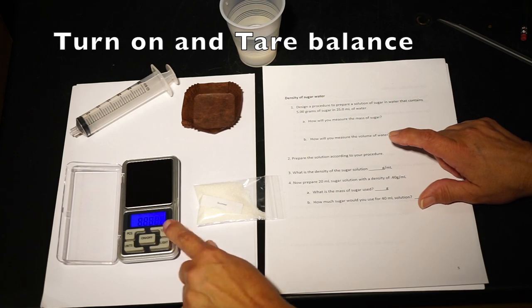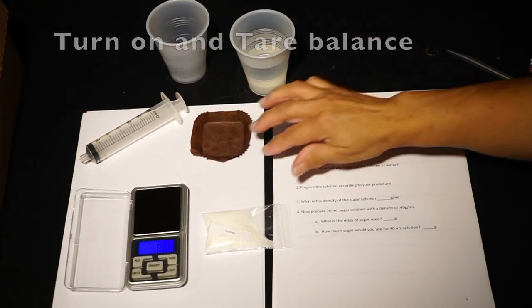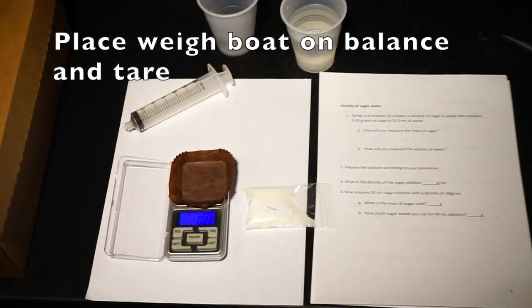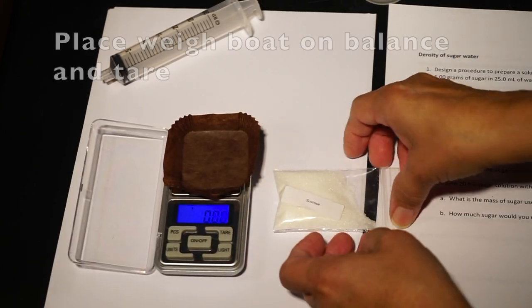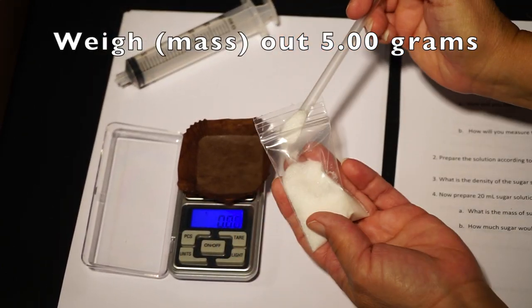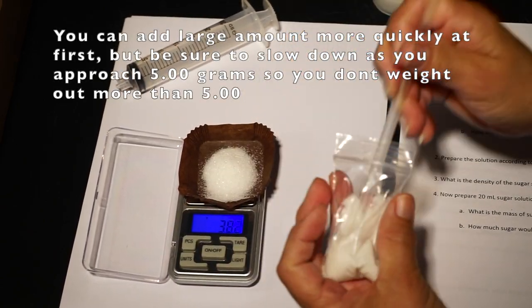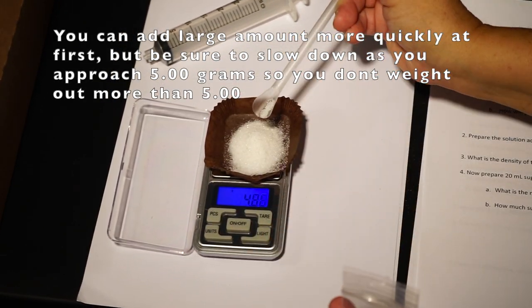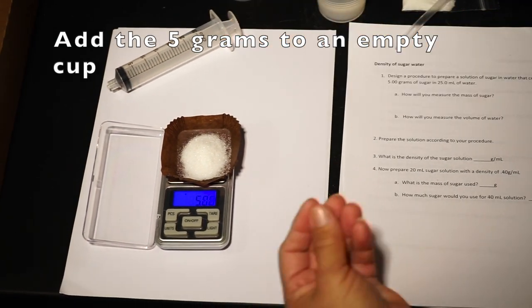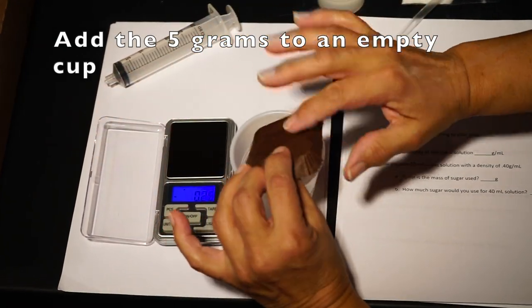First, turn on and tare your balance. Add a weigh boat to the balance and tare it. Use your spatula to weigh out 5.00 grams of sugar. You can go quickly at first, but be sure to slow as you approach 5 grams. Add the 5 grams of sugar to an empty cup.